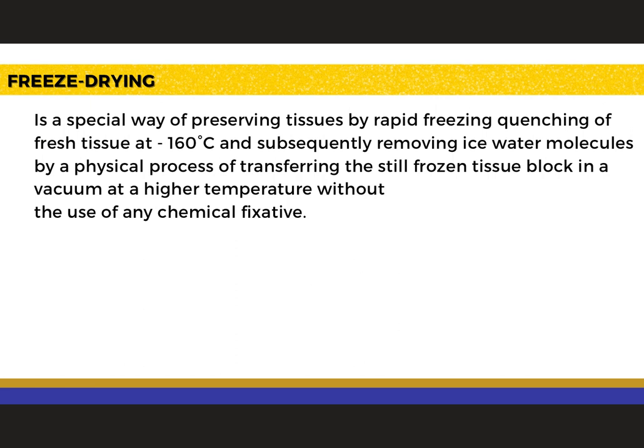So the first one is freeze drying. So this is a special way of preserving tissue by rapid freezing, quenching of a fresh tissue at negative 160 degrees and subsequently removing ice water molecules by the physical process of transferring the still frozen tissue block in a vacuum at a high temperature without the use of chemical fixative.